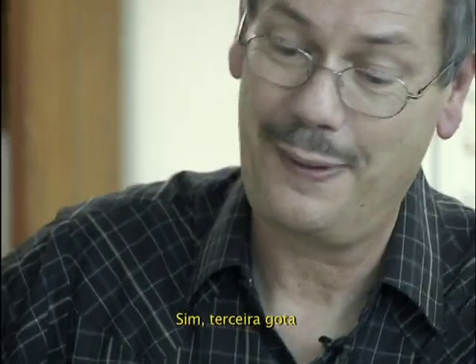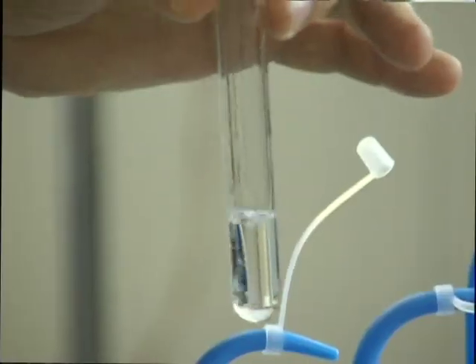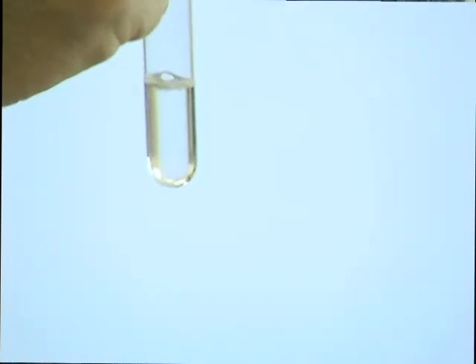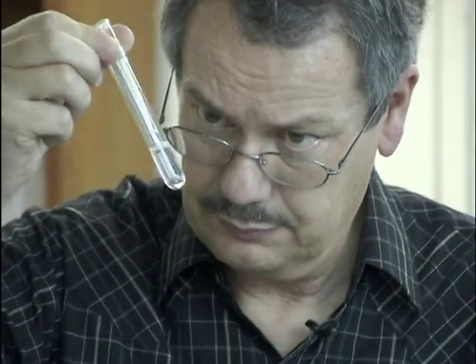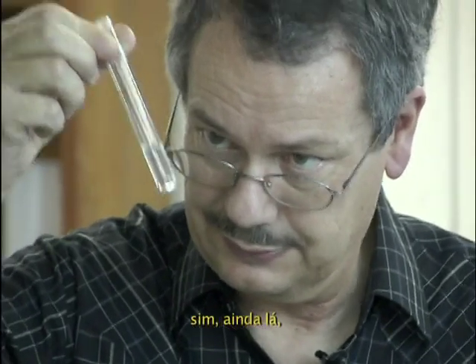Third drop. I have bubbles there. The third drop. Still there. Yeah, still there. So I'm going to wait for that one.